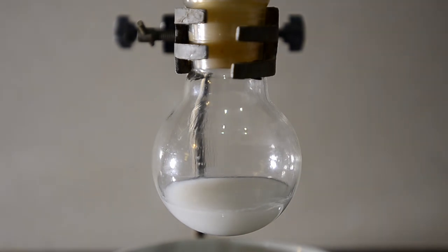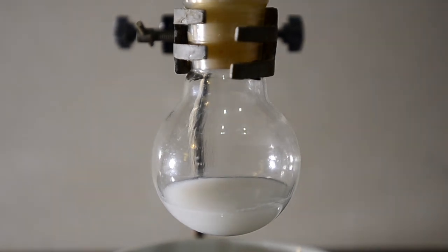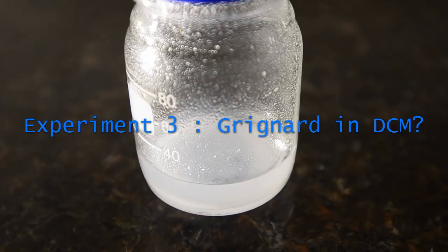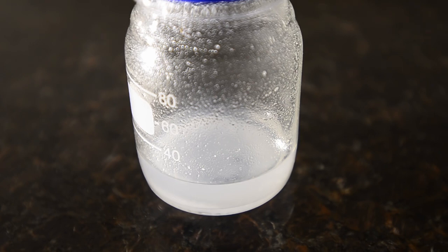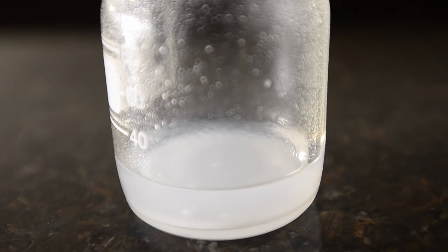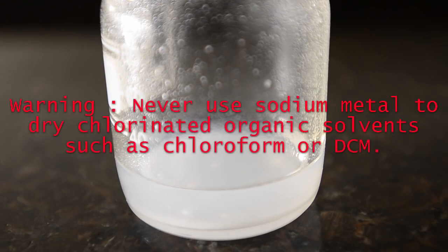We then did a third experiment. We wanted to see if it was possible to use a different solvent than ether. So we took some dichloromethane and dried it in a bottle using a small amount of phosphorous pentoxide. Do note that you cannot dry chlorinated solvents using sodium metal. This is extremely dangerous and can cause an unpredictable explosion.